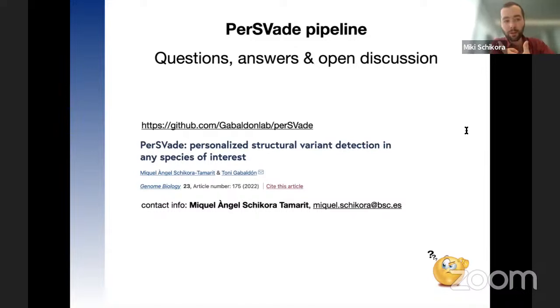The way these structural variants are detected is based on split reads, discordantly aligned pairs, where you have one read of the pair here and the other somewhere else, which is evidence for a structural variant, and also de novo assembly of these complicated regions. So it integrates these three types of information. It should be able to handle interchromosomal events and any type of structural variant in principle.